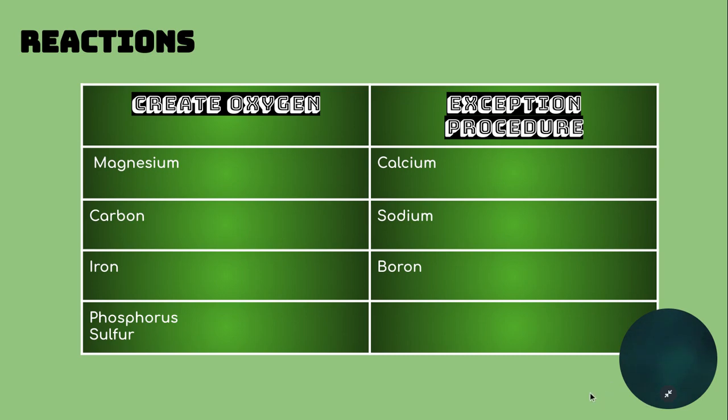However, some of the elements have specific instructions that don't require you to make your own oxygen to react with. So here's a list of the elements that don't require you to make your own oxygen. They create an oxide in a different way that the instructions will explain to you. I just made a list here so you don't waste time making more bottles than you need.